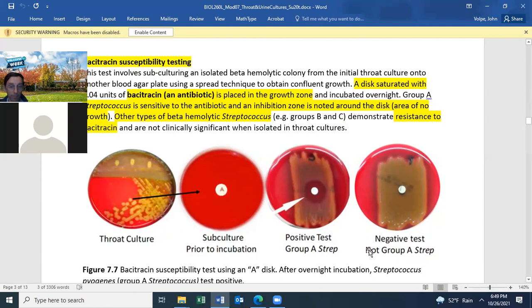The other beta hemolytic bacteria that are catalase negative are not susceptible to bacitracin, and they generally have no zone of inhibition. You do need to measure that zone of inhibition to make sure that the organism is resistant to bacitracin. Is that right? No, sensitive to bacitracin. This is resistant to bacitracin.